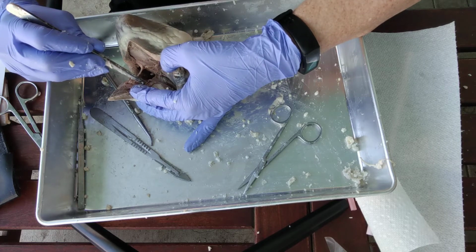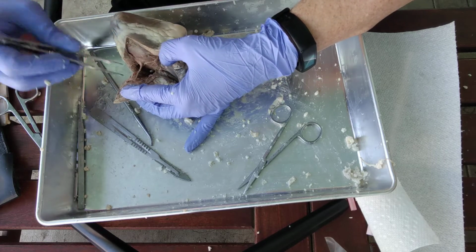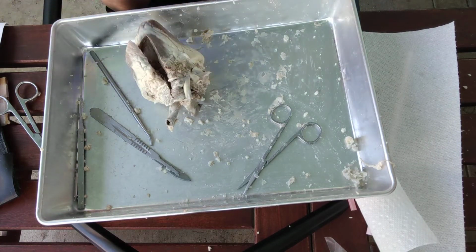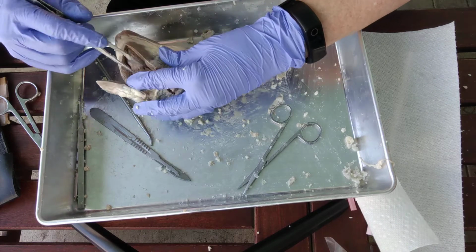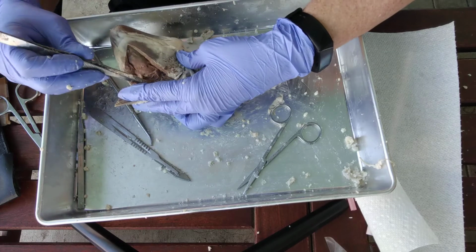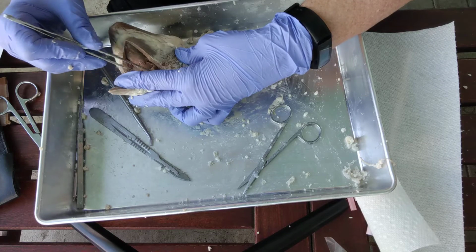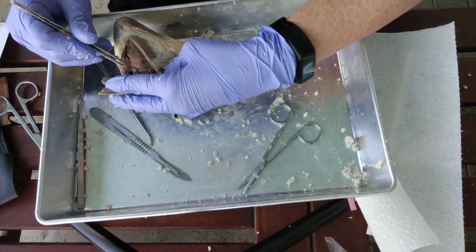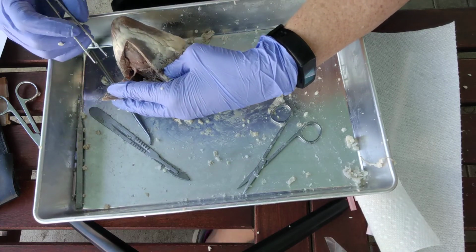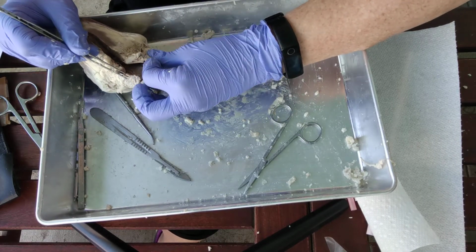Okay, so these little strings, those are called chordae tendineae, and what they do is they anchor the cusp so that when the ventricle contracts and the blood is going to try to go up into the atria, okay, it's going to try to escape the high pressure, go to the lower pressure, and that blood's going to get trapped into these little cusps. So the cusps trap the blood, and that closes the valve. And these chordae tendineae, all they do is they hold on to the cusp and anchor it down so that it doesn't blow back into the atrium here.